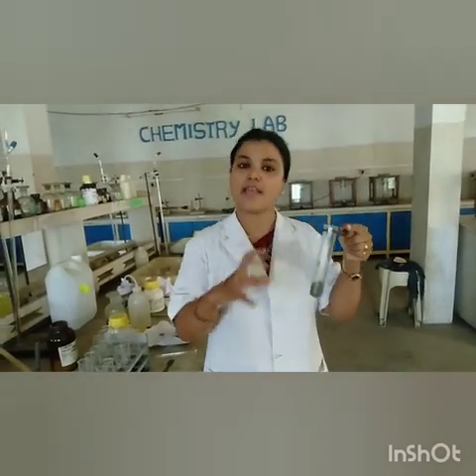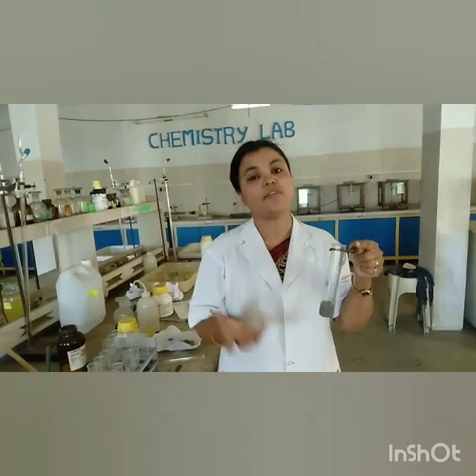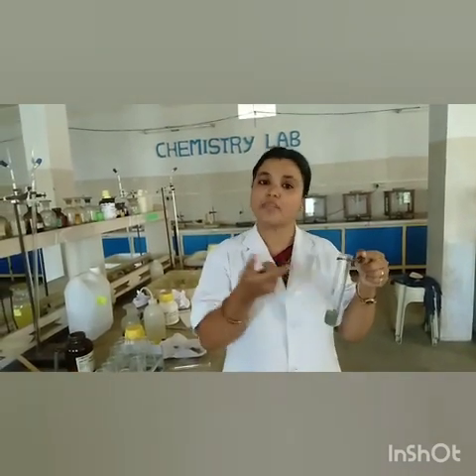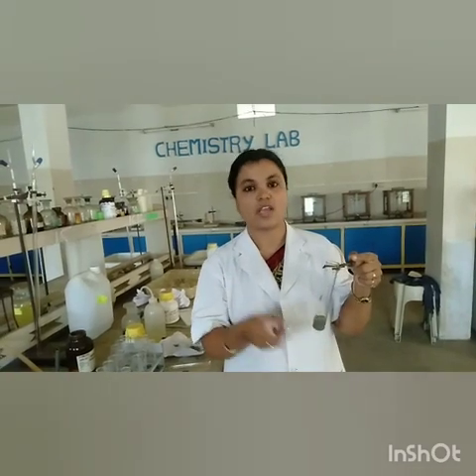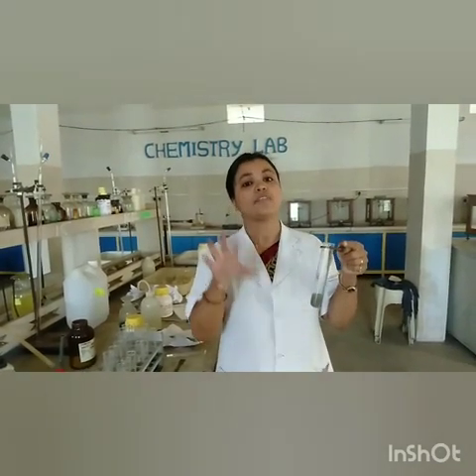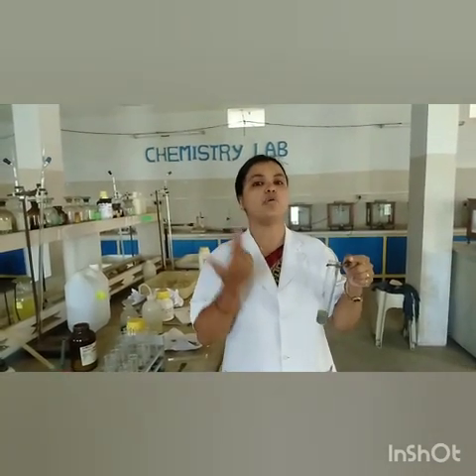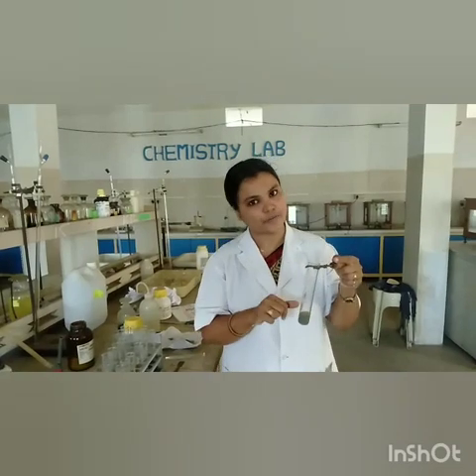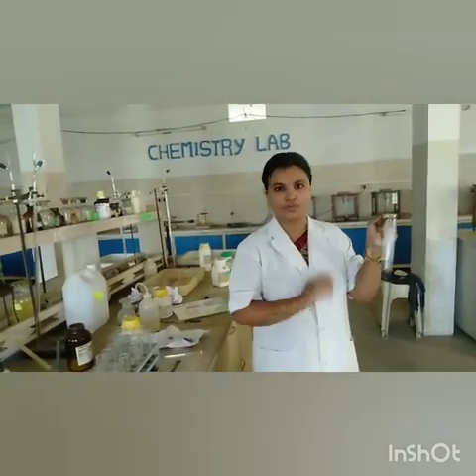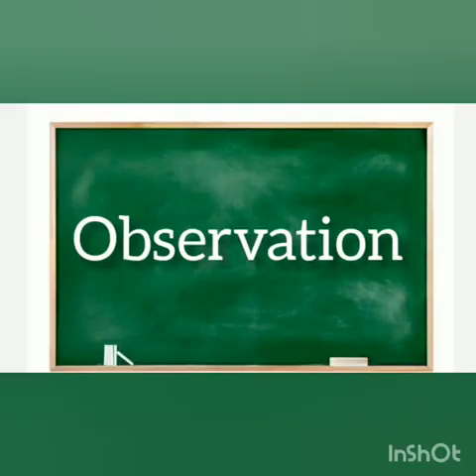That means that a reaction has happened. And when will a reaction happen? Whenever the metal is more reactive than the metal which is present in the solution. Because of the color change, we know that a reaction has happened, and it is because aluminium is more reactive than iron. So here is the proof. Okay, thank you.